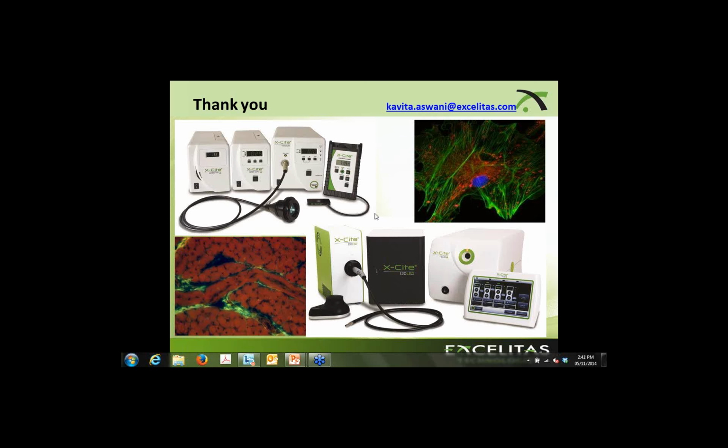You're looking at spectral imaging all the way from 350 to 700. If you're comparing two separate samples at these different 50 nanometer chunks, then you might have some luck. But if you're comparing one 50 nanometer chunk with the other in the same exact sample, that might be more tricky. And if that was completely unclear, you can contact me offline.